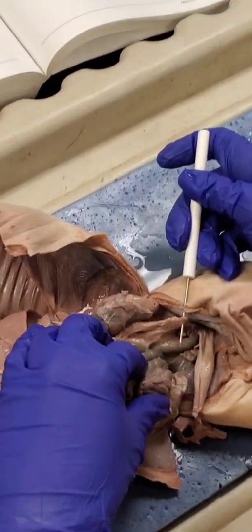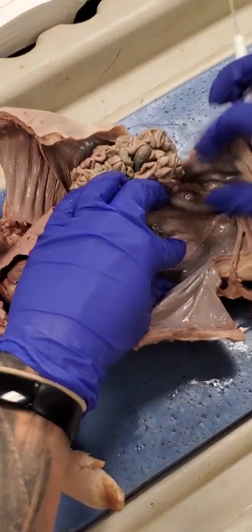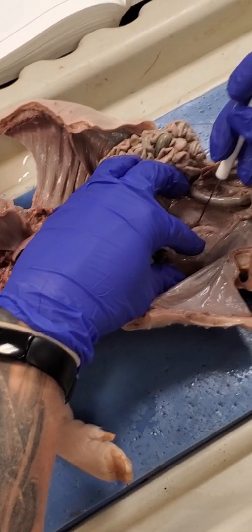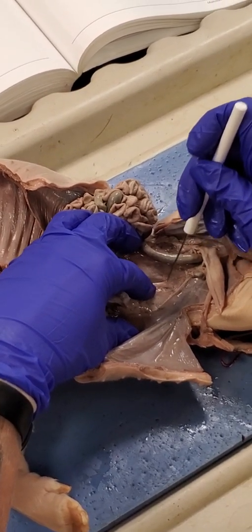Can you see it on the other side where there's all the connective tissue, or is it just covered? I'd probably have to cut it. It looks like this right here, yeah. That's it. And you will cut it out, right? Yes, I'm going to cut everything clearly. I don't want it hidden by connective tissue.